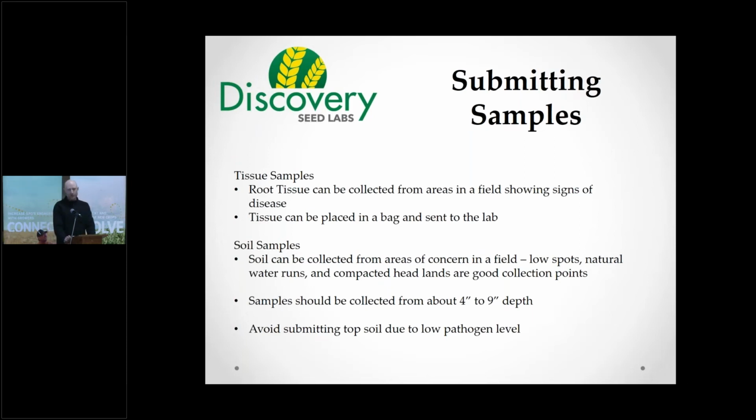You want to collect your soil sample from about a 4 to 9 inch depth range, depending on the soil profile of that particular field, and avoid submitting any topsoil due to the low pathogen level. It exists at root depth.